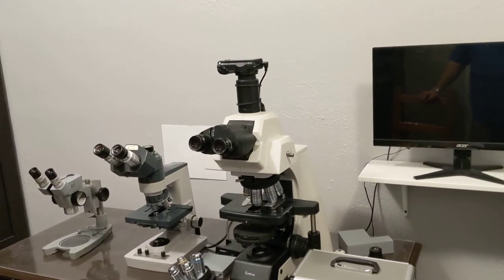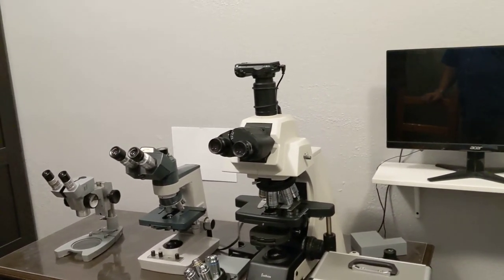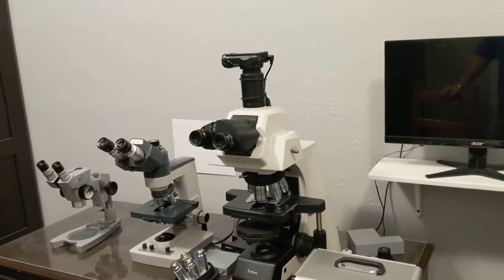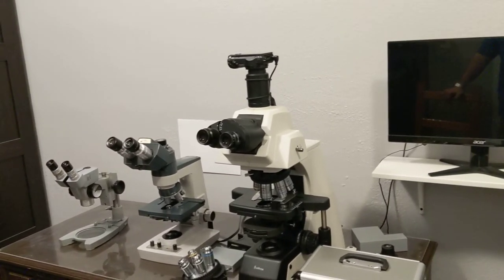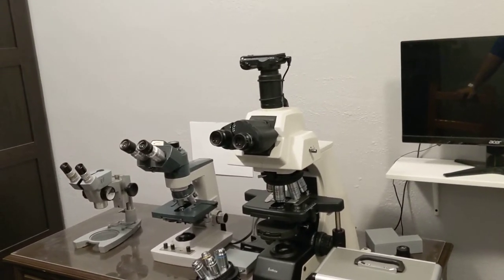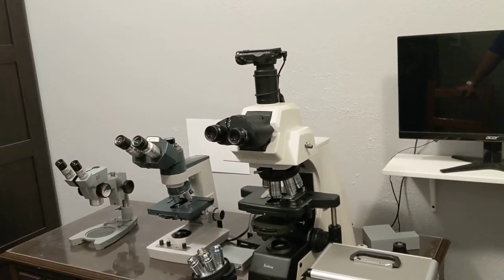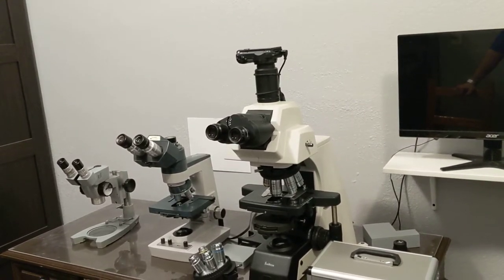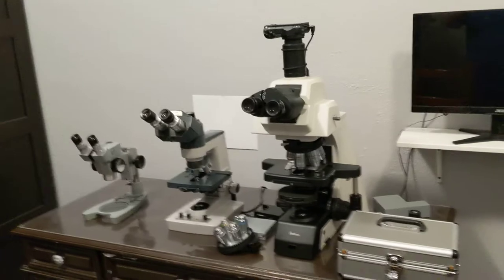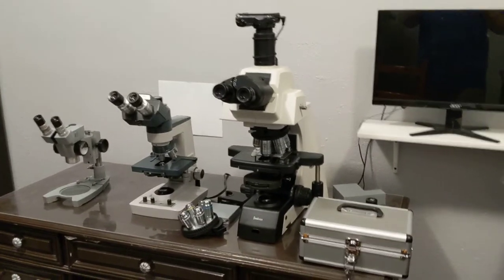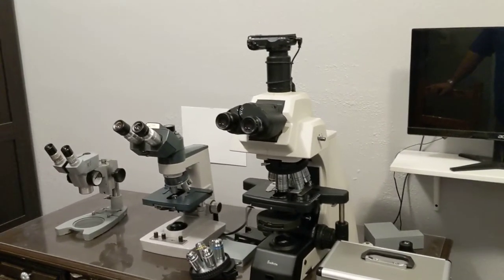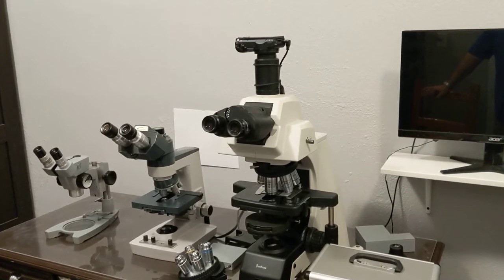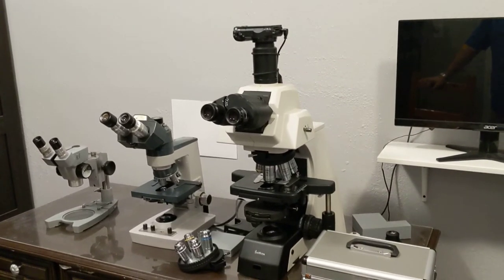This is my review of my Best Scope 2081 microscope, my new microscope. This is a microscope that I think deserves a good bit of attention. It's actually quite an exciting concept.